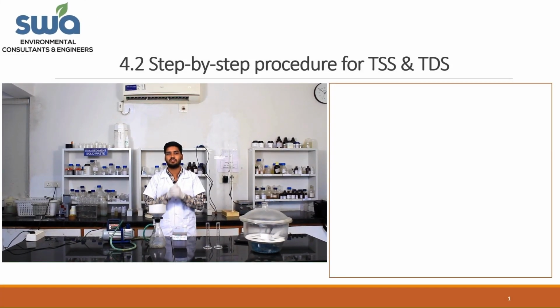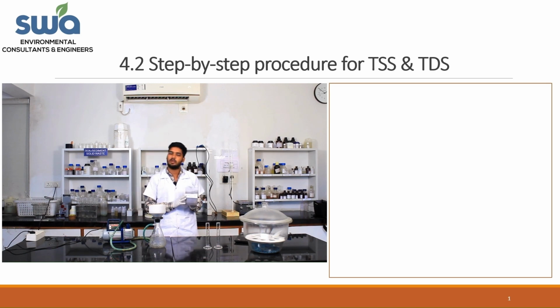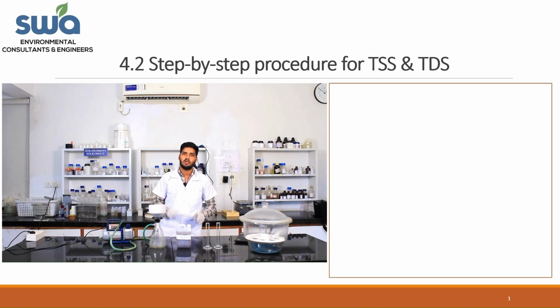So now let's start with the procedure of measuring the TDS and TSS in a given sample. Here we have the sample of the aeration tank. In this sample, we will measure the TSS and TDS first, and then VSS and FSS. All of these parameters we will measure in this sample.